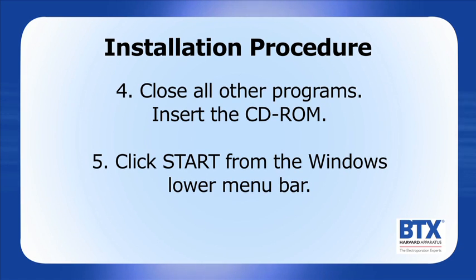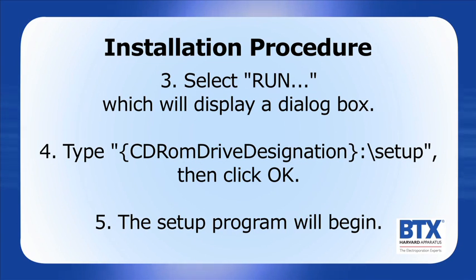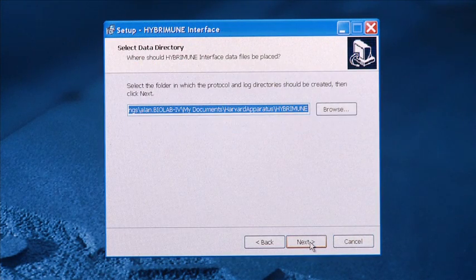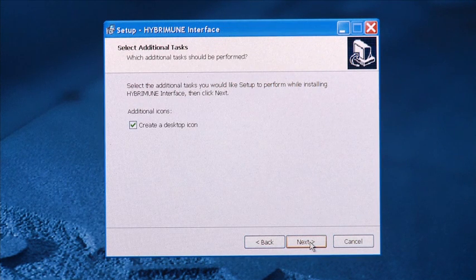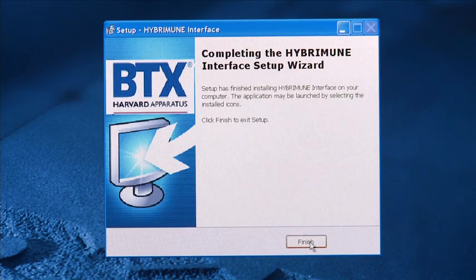Close all other programs and insert the CD-ROM. Click Start from the Windows lower menu bar, select Run, which will display a dialog box. Type the CD-ROM drive designation colon slash setup, then click OK. The setup program will begin. Once setup is complete, the completing the HYBRIMUNE interface setup wizard will appear. Click Finish.